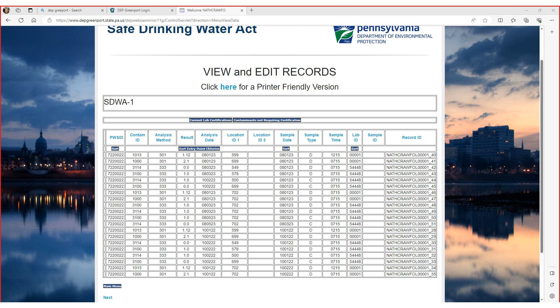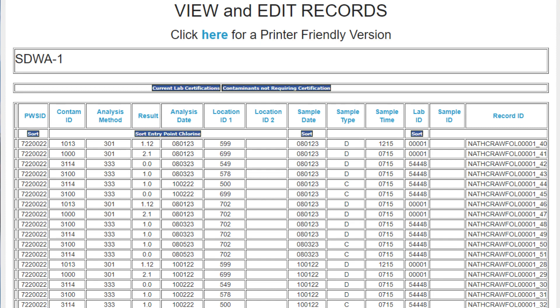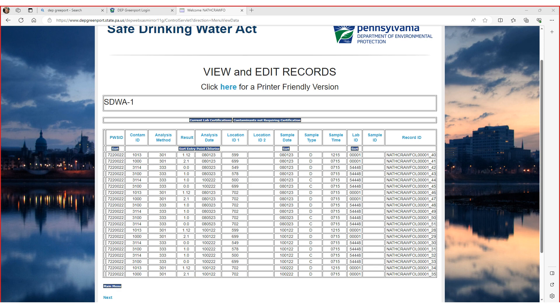In this case, you should call DWELLR Assistance at 717-722-4018. In this example, you know from talking with your accredited laboratory that there was a total coliform positive sample on August 1, 2023 at location 702 and that the three required check samples were taken. You can see the total coliform positive sample, but only one of the check samples. You should then reach out to your accredited laboratory and let them know that two of the check samples have not been entered. Similarly, you can view the error report and identify records submitted by your laboratory with errors and contact the laboratory to correct these before the 10th of the month. Also, in View Access, you can check your counts. If you entered 31 daily chlorine residuals and the lab was supposed to enter total coliform results, but you see that the count for SDWA-1 is still 31 and it's the 10th of the month, that is a clear indication that the total coliform records have not been submitted.